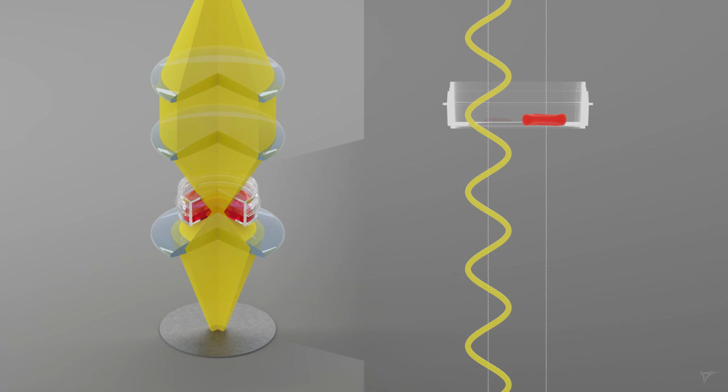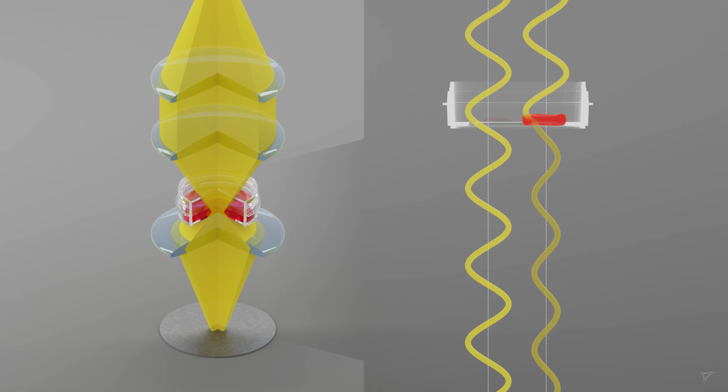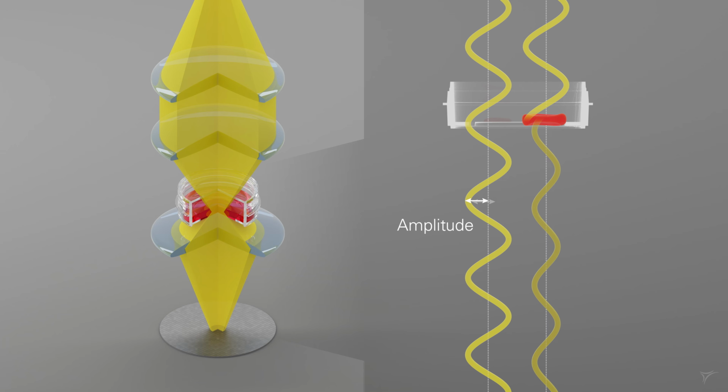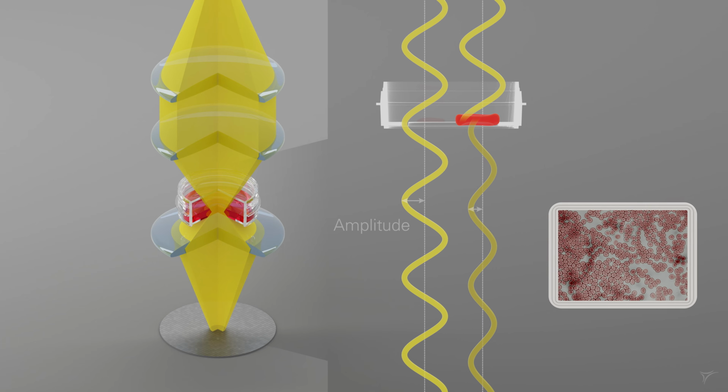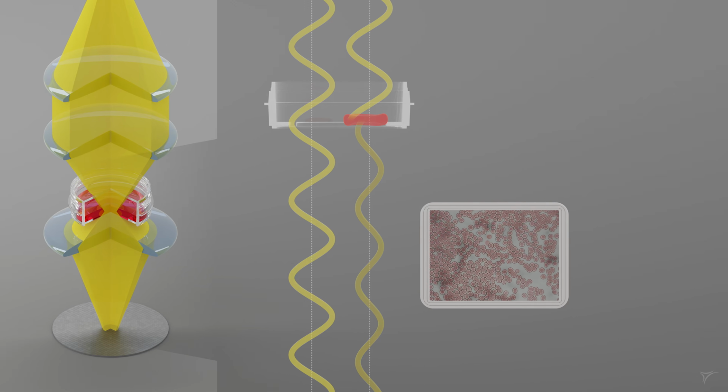When light passes through pigmented cells, like erythrocytes, it is highly absorbed. The high absorption reduces the light's amplitude, thereby decreasing its intensity. As a result, the absorption alone is sufficient to create a significant contrast between the pigmented cells and the surrounding medium, making pigmented cells visible under the microscope.